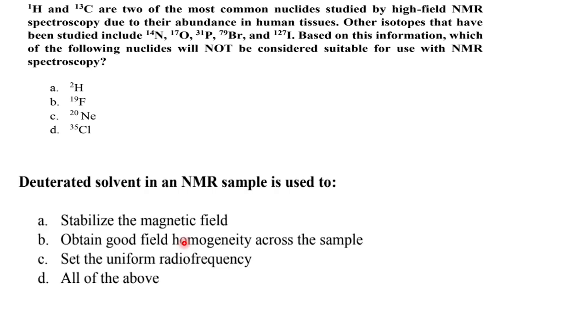So we have discussed today about the NMR spectroscopy. We have discussed a little bit about 13C. Next week we will discuss solid state a little bit and also 2D NMR. And here I have set a few questions. Is it clear to all whatever we have discussed today? What are the basic conditions or criteria required to be NMR active? And then what is spin coupling, or what is delta, shielding, deshielding?